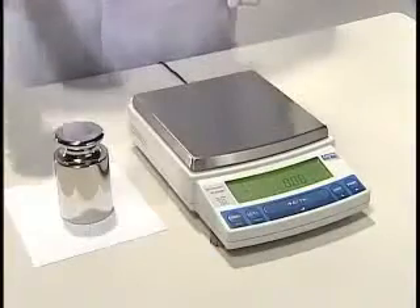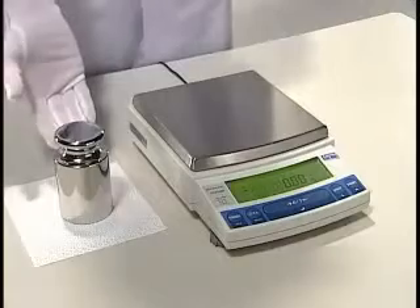Oh hi everyone, sorry to startle you all like that, but this demonstration was designed just to show you how strong this device really is. Of course, please don't try this with your own unit. Does the scale still work, you say? Of course — I've got a weight here that is 2,000 grams.